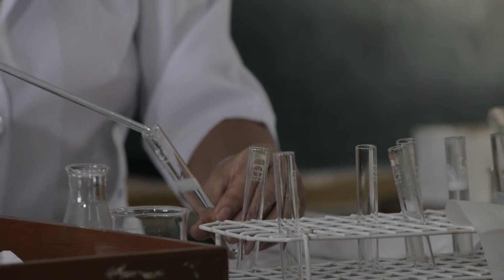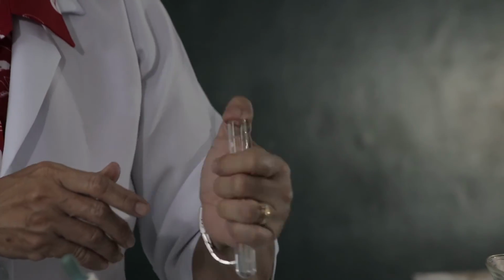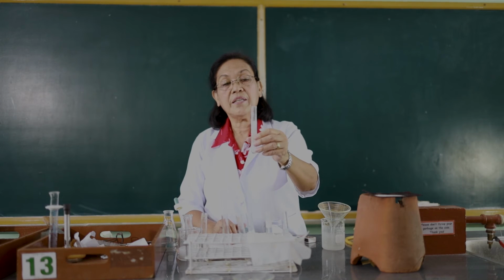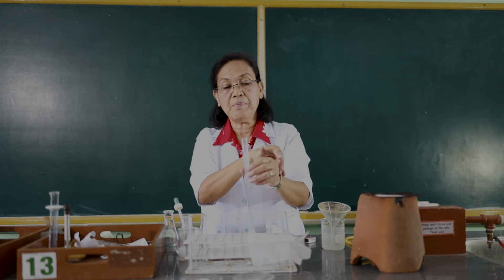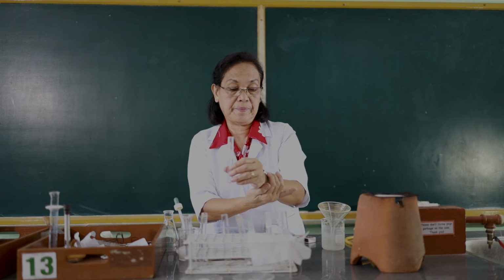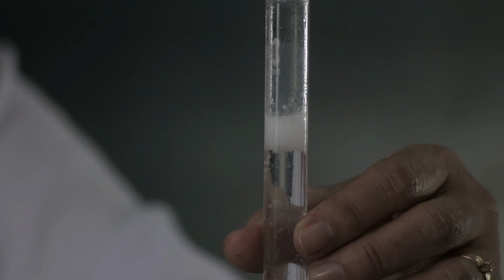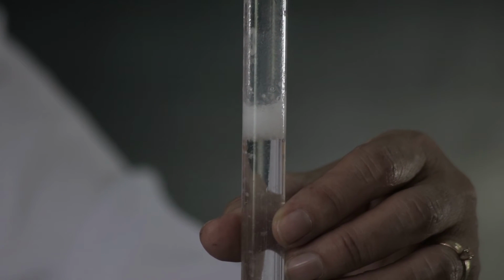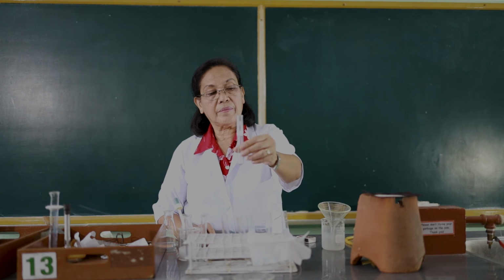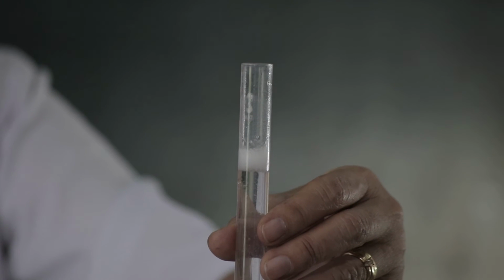One, three, four. Five, six, seven, eight, nine. There are already bubbles formed on top of the liquid part, and let us try to take note whether these bubbles will burst within 1 minute or not. Okay, 1 minute had passed and the bubbles are not burst. So this means this is already a good lather.